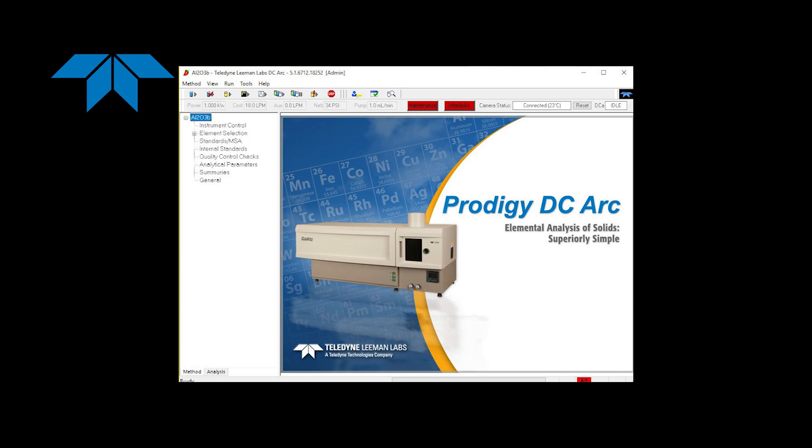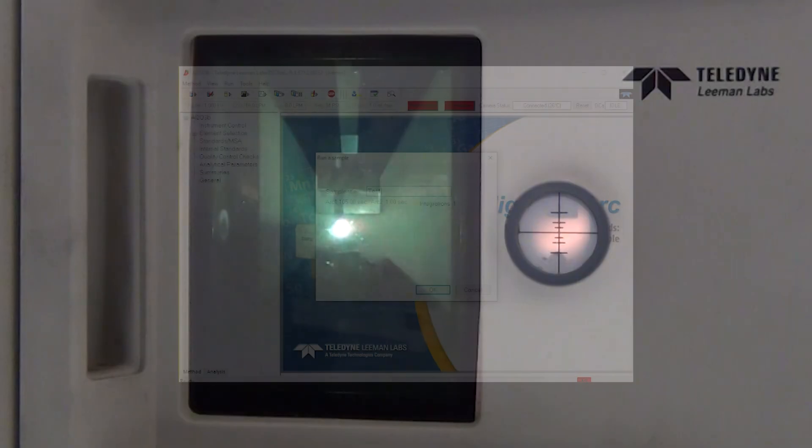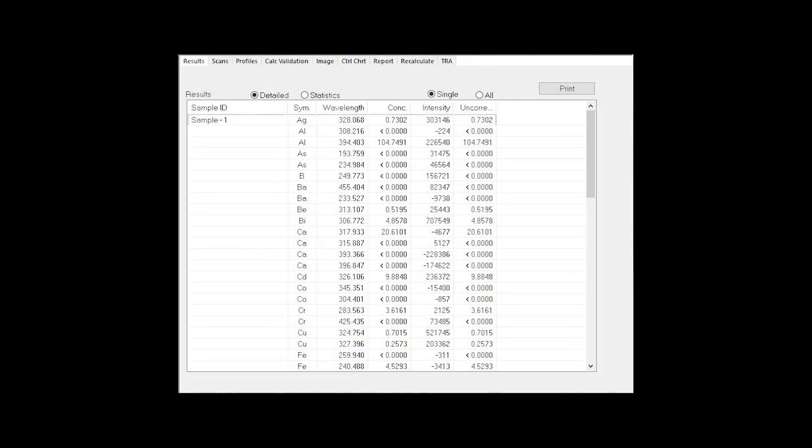The elements to be measured are determined by the method that is selected in the instrument software. The operator clicks the Run Sample button, which ignites the arc and the sample is analyzed. Once the sample is completed, the results are immediately displayed on the screen.